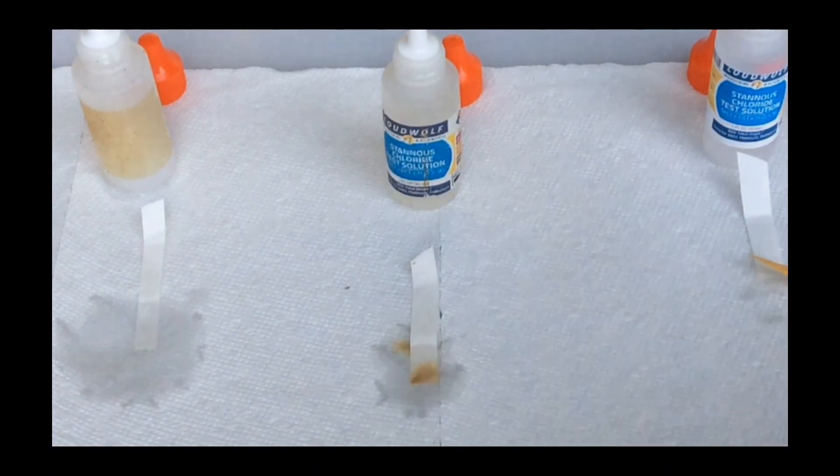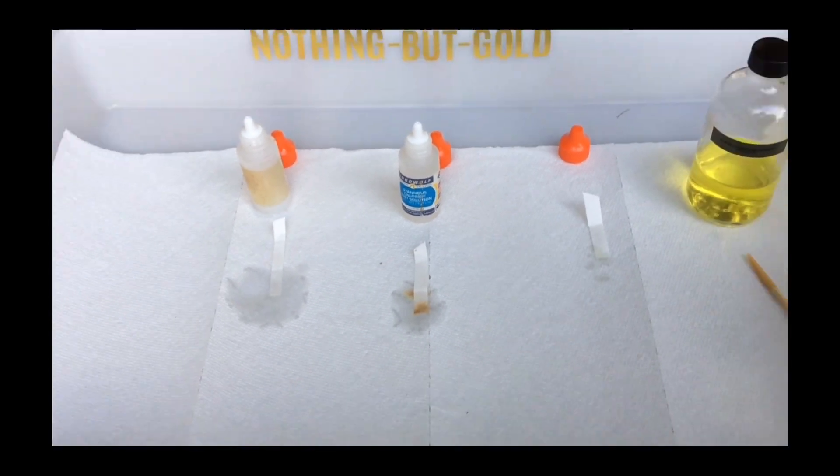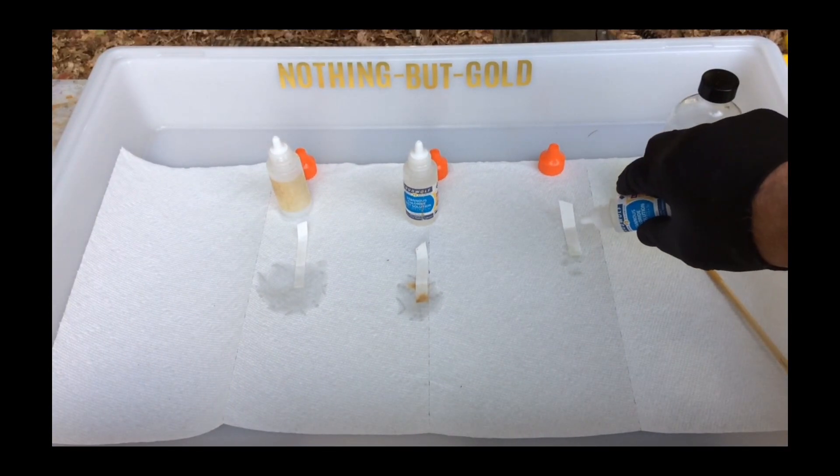As you can see, the leftmost bottle of Stannous Chloride produces no dark stain. It is 100% useless. It must be discarded properly.